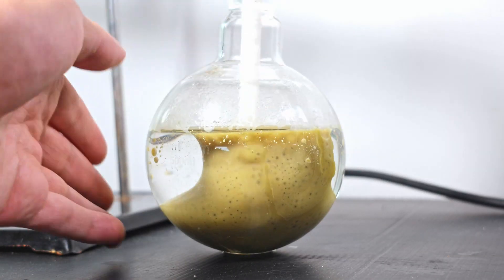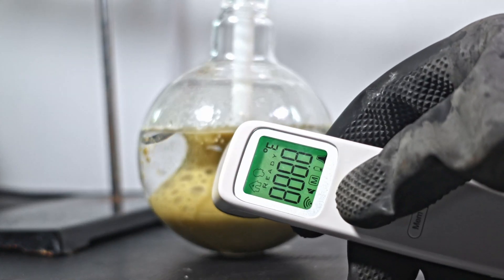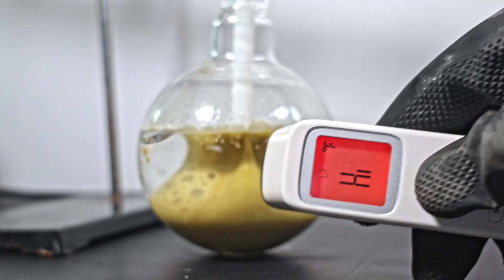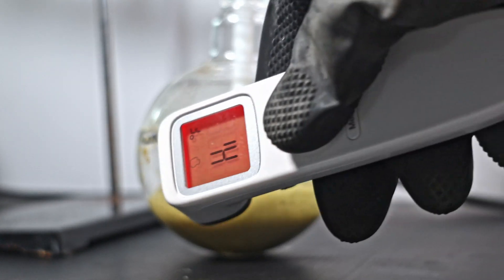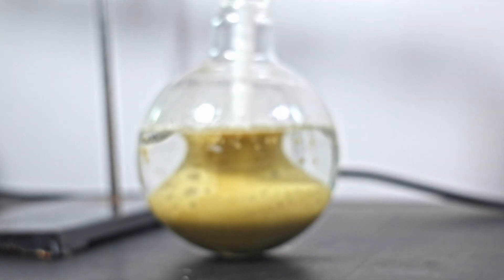Twenty minutes later, the reaction has released so much heat the flask is almost untouchable. My little thermometer is registering beyond 40°C. Another thing to note is its increased density — the oil has now swapped places with the water, residing on the bottom of the flask.